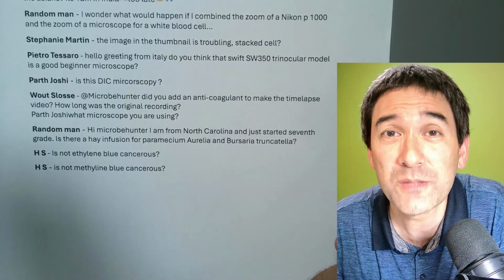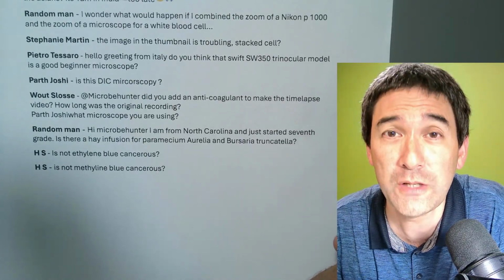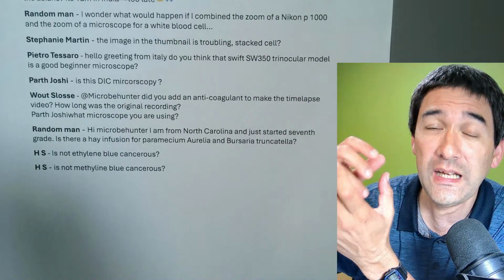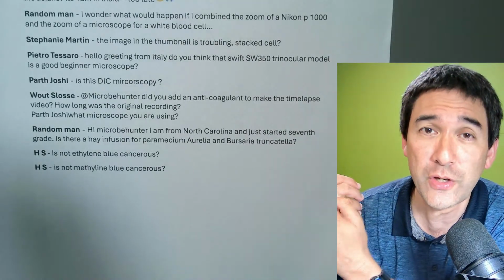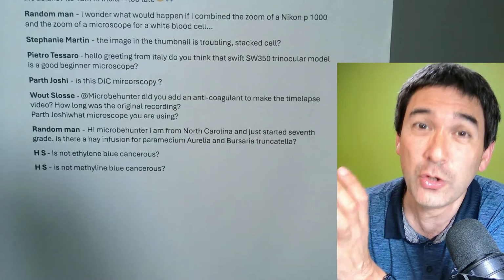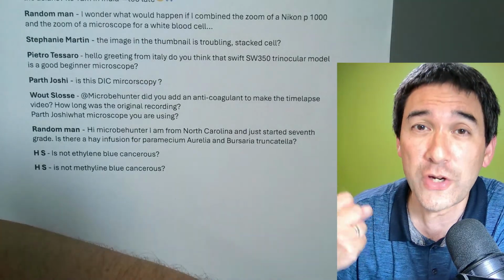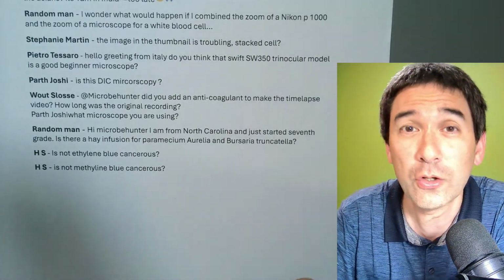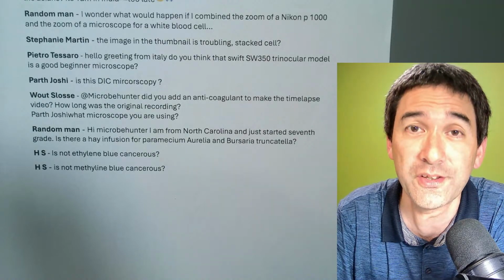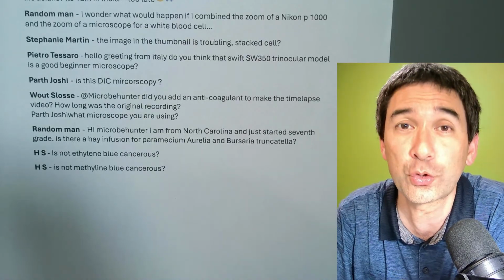However, that's why I'm a little bit not so happy with hay infusions. The hay infusions basically have a lot of bacterial growth, especially if you take a large jar and put hay and water in it. It really has a high concentration of bacterial growth, so it's possibly not healthy. It's kind of like you're decomposing this material. And second, because of the high concentration of bacteria in there, they're using up all of the oxygen. And this basically means that Paramecia and other ciliates, which need a lot of oxygen, essentially cannot grow well.